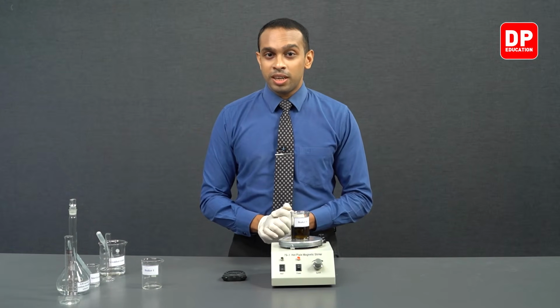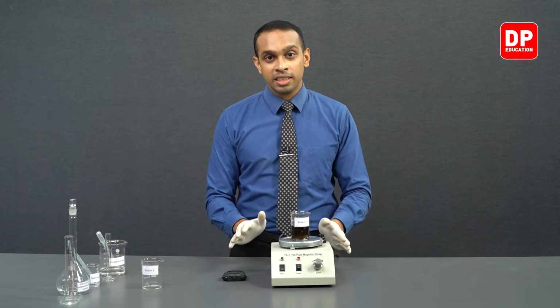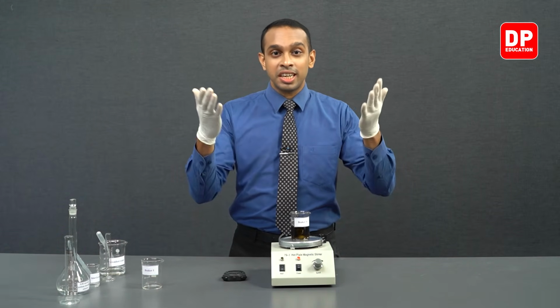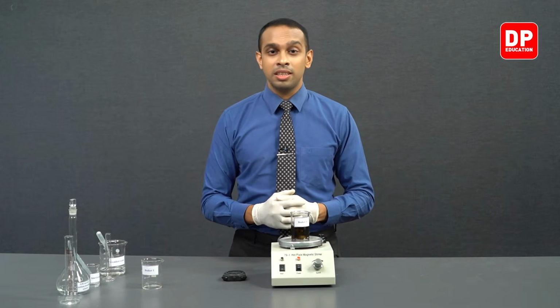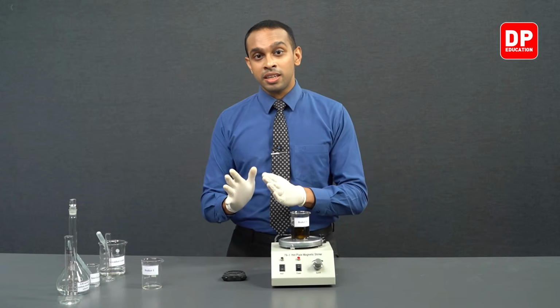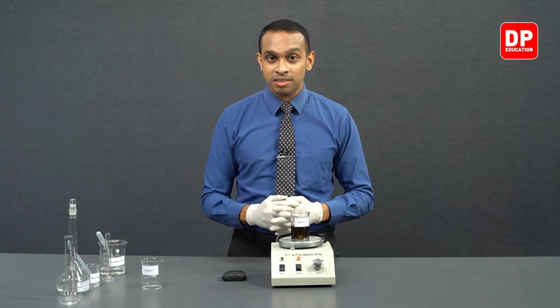Now students, as you observed, when we kept on decreasing the iodide ion concentration, the time taken for the same observation to appear increased. So this is indicative of the fact that iodide ion concentration is important when it comes to deciding the rate of the reaction.